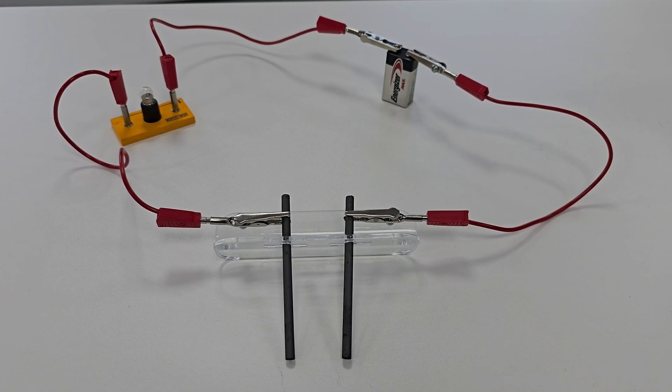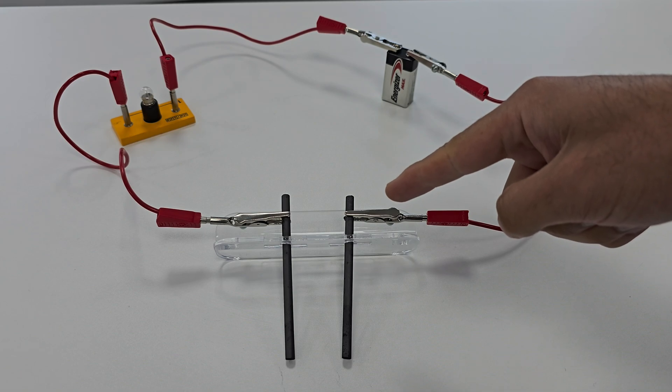For this experiment I've set up a simple circuit with a light bulb that lights up when a conductor completes the circuit. The circuit also includes graphite electrodes that will help us test our substances.